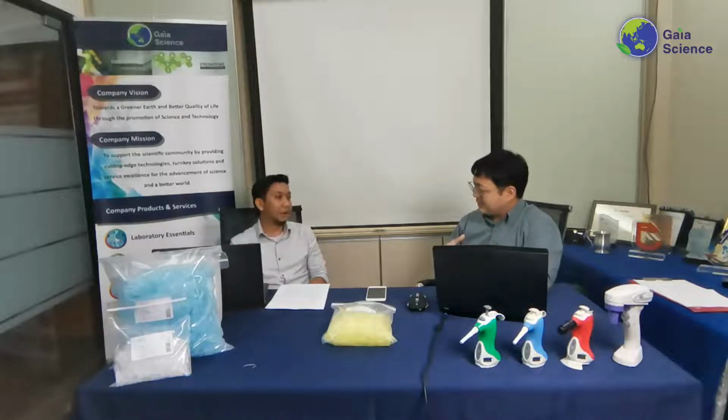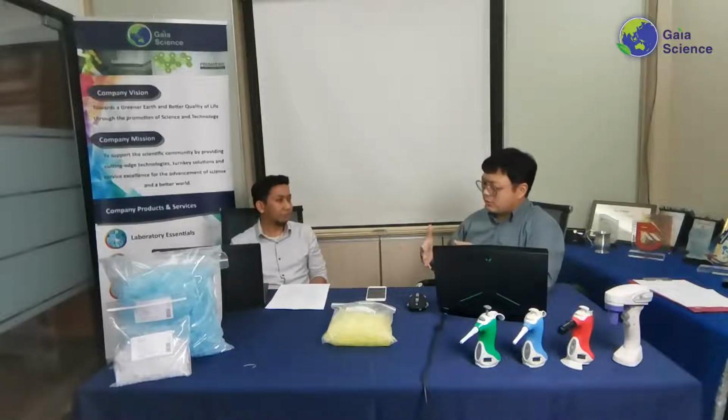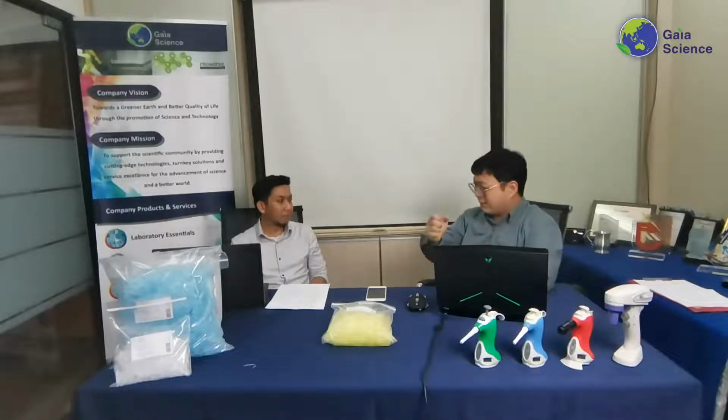If you're working with RNA or DNA, we don't want to get your sample degraded, isn't it? Yeah, or even PCR as well. Yeah, right. So those are the ones where you want to just get the sterile one straight away. Just solve all the problems that you might get from buying bulk.